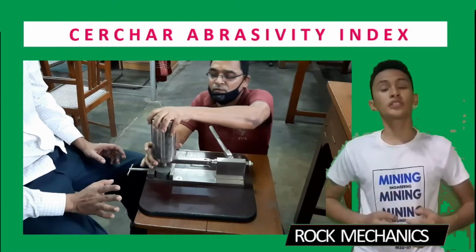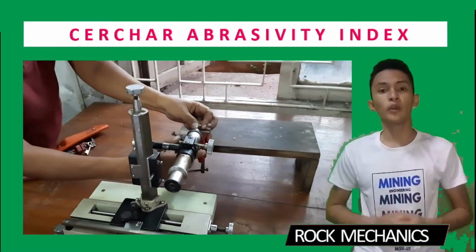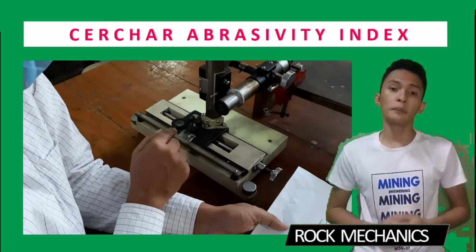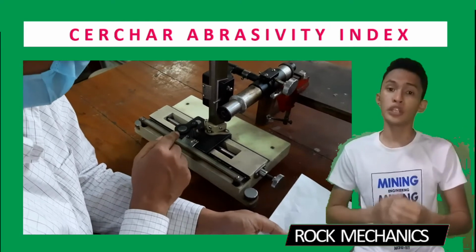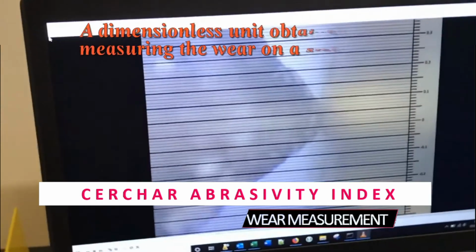After testing, the stylus is carefully lifted from the rock surface and the stylus removed. A minimum of 5 test replications must be made on the rock surface, each time by a new or re-sharpened stylus. Stylus wear measurement.